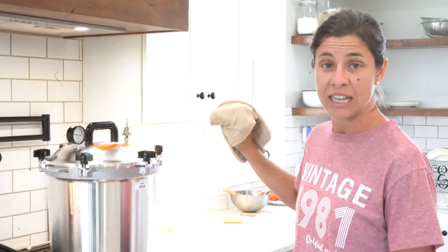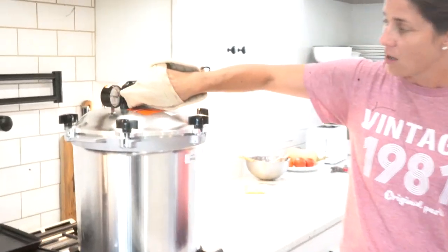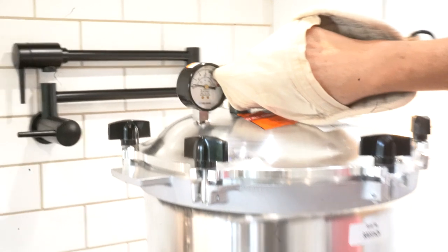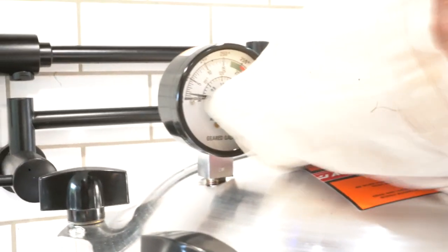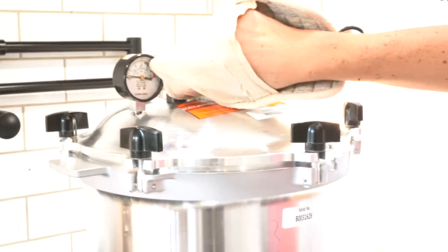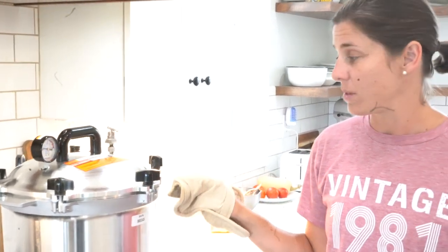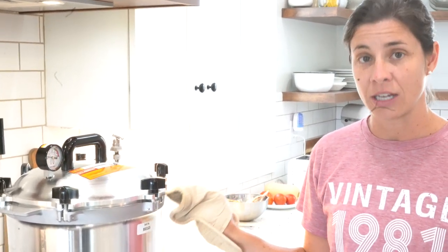It's been venting for about four minutes now. We were up in the green and we are now back down to zero — that was about three to five minutes. I'm going to go ahead and close this back, and we will now start building pressure back up. Once we get pressure back up we are in the sterilization zone. Doing that twice ensures there is no air trapped in there that would prevent the sterilization from happening.